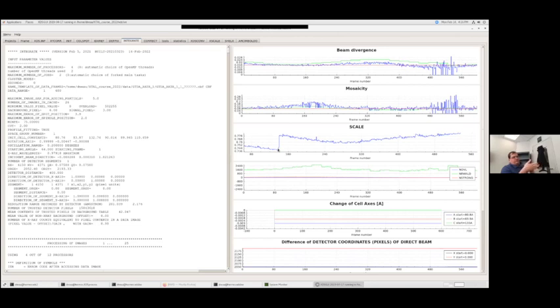which is perpendicular to the beam, I'm going to have a relatively thin cross section of that crystal. Therefore, I'm going to need a larger scale factor, because my reflections are going to be weak relative to if I'm looking with the large axis of that plate parallel to the beam. Now I'm shooting through that thick part of the crystal. It's going to have a lot more crystal volume that's diffracting, and therefore it's going to generate stronger spots relative to when it's perpendicular to the beam.